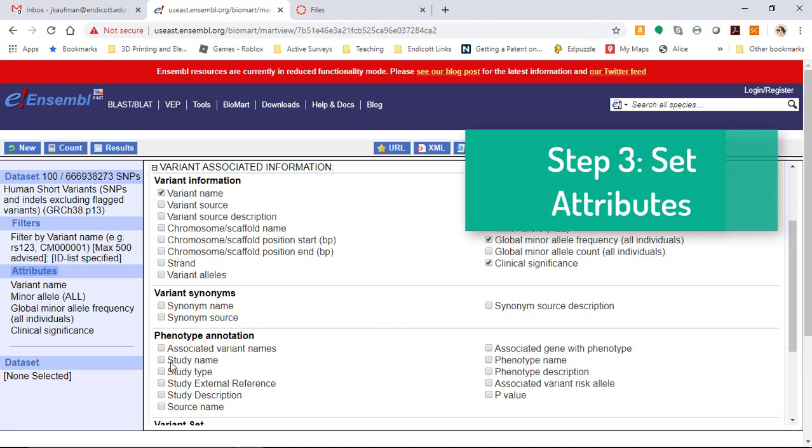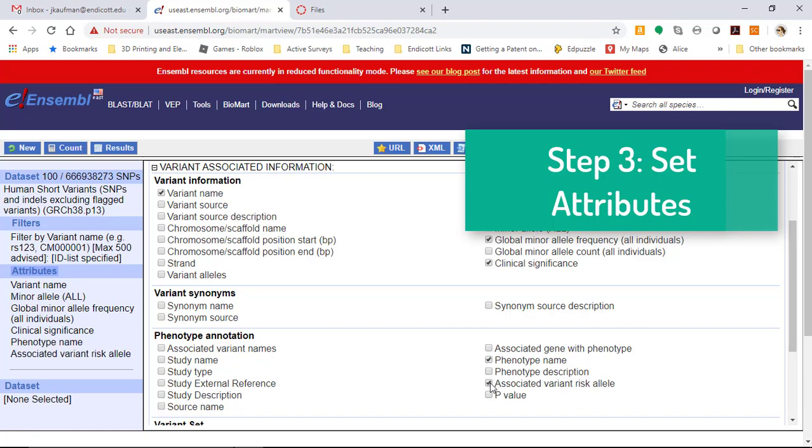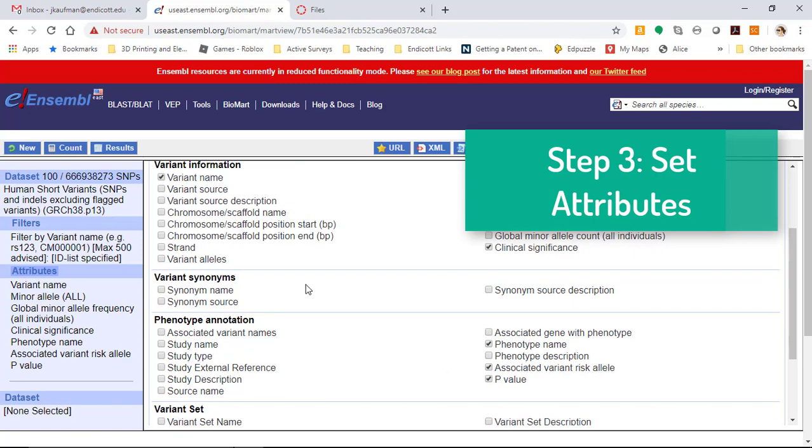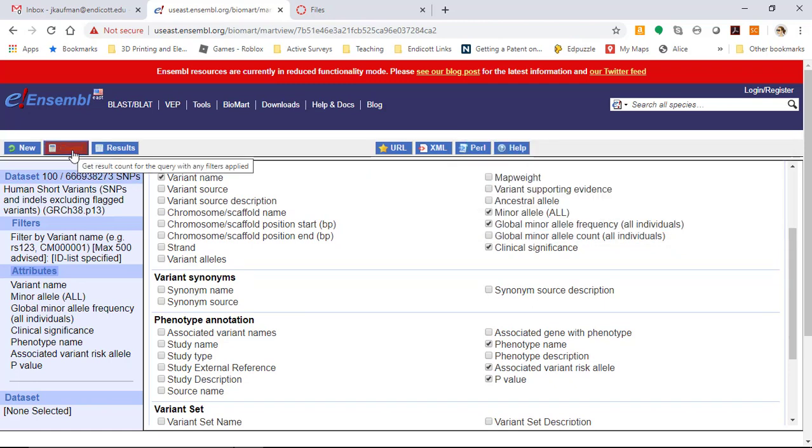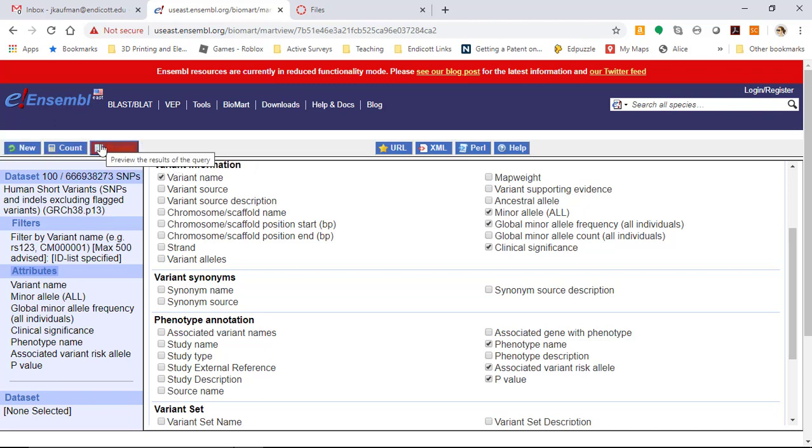We also have all of these columns for phenotype annotation. We can look at the individuals, the phenotype name, the associated risk allele, and the p-value. I'm going to add those three columns to start. Now instead of just counting how many rows in the database match my filter, I'm going to click results.